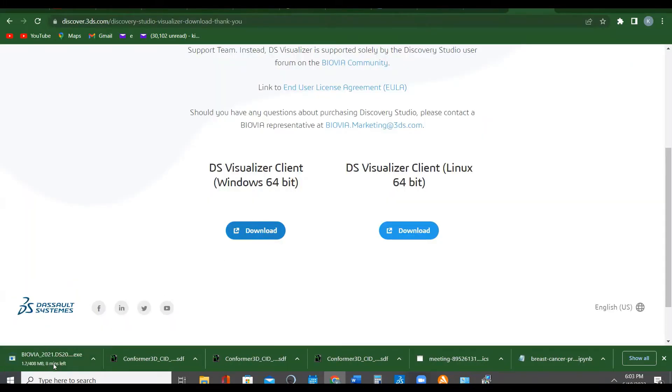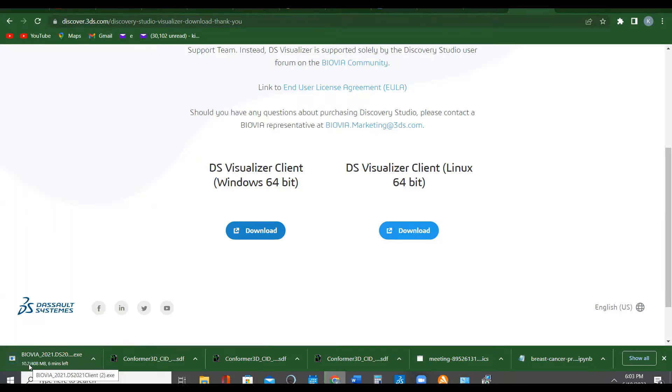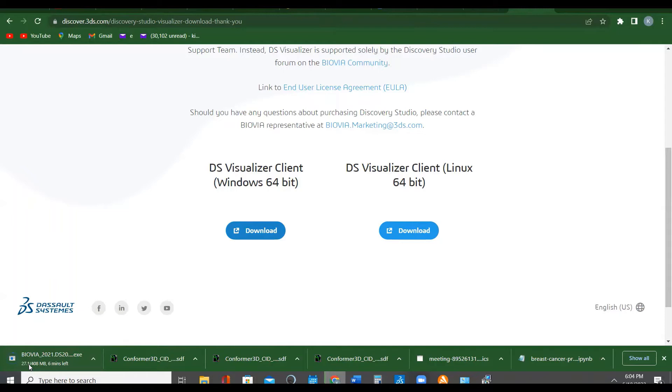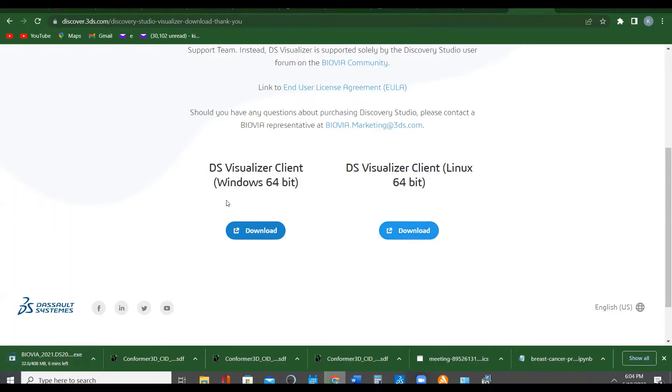It automatically downloads. Can you see? It's about 408 MB, so you wait for it to download. Once the download is complete, wait for that to download. So are we downloading the Linux 64-byte or the Windows? I'm using Windows. Download the Windows version.